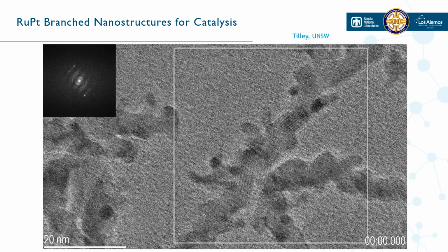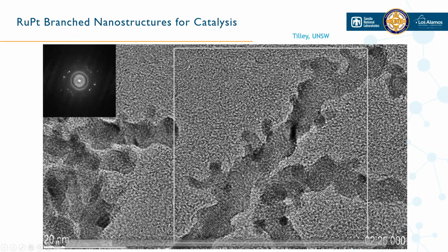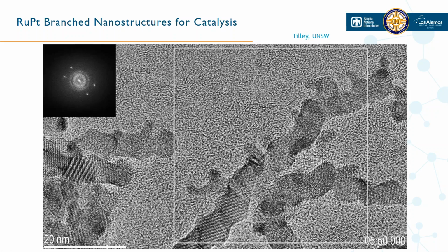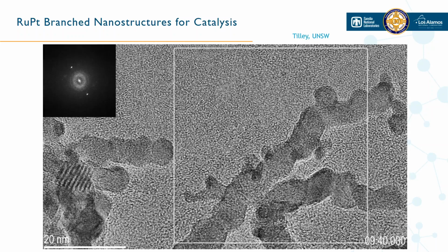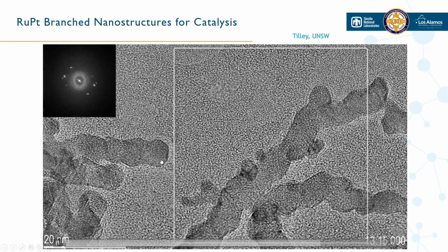So the other thing that I will note here on this video, this is all done within GMS. So this is all done with the tools available to the user in the easily usable user interface. So this can all be done kind of at the workstation or at your laptop.